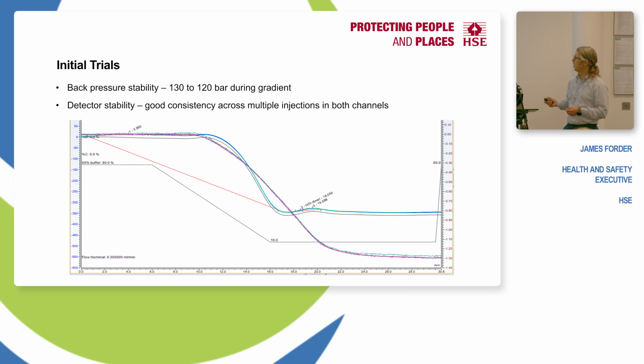That's the software tool. In order to actually work through the run, it has to be consistent. So this is overlaying injections of the detector, three consecutive injections, with a very consistent detector background signal. There's no injection here, this is just a mock injection. The injections didn't run, but everything else about the run worked. So you get good consistency. Excellent. Moving on to the next step.